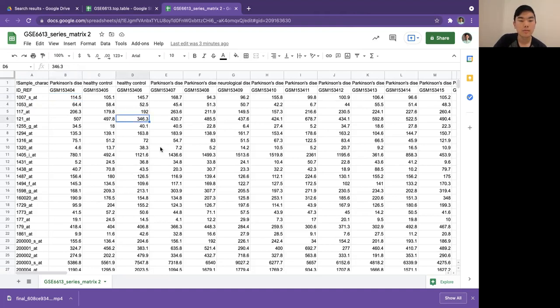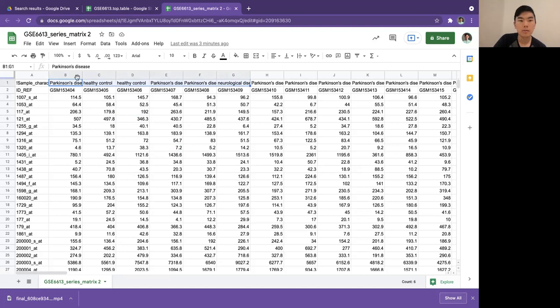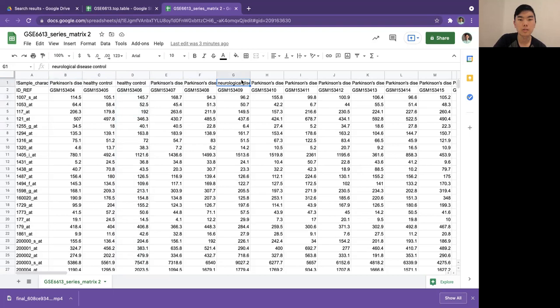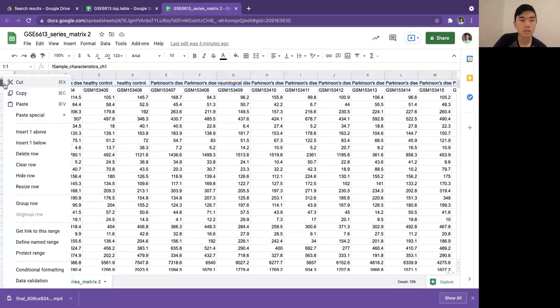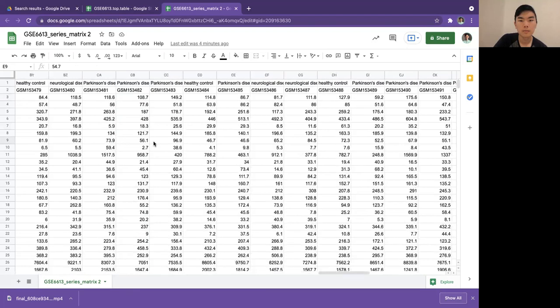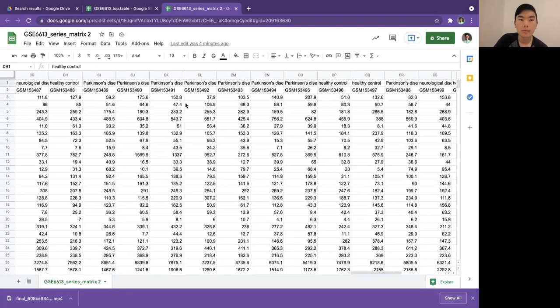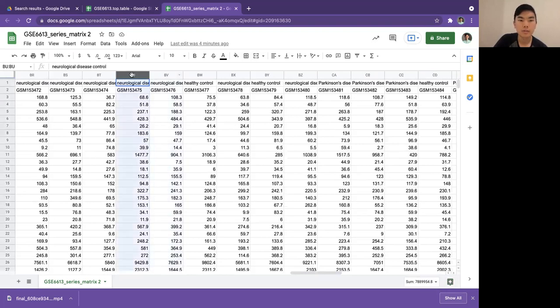One thing you'll probably want to do is group the Parkinson's disease and healthy controls together. Right now it's kind of split up like Parkinson's, healthy, healthy, Parkinson's, Parkinson's, neurological. You probably want to group all the Parkinson's together. One way to do it is to manually drag, you can drag this around.